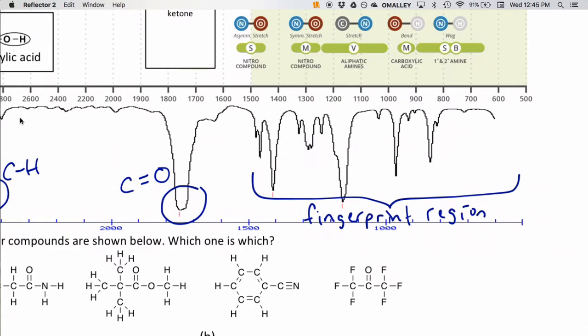Well, different bonds, when they're connected to one another, for any bond between one atom and another, are not as rigid as you might think they are when we draw them. They can stretch back and forth, they can wiggle, they can vibrate, they can rotate, and all of those types of little transformations involving the covalent bond absorb different types of energy in the infrared region. And that's what we're seeing in the fingerprint region primarily, which is why it gets so crowded.